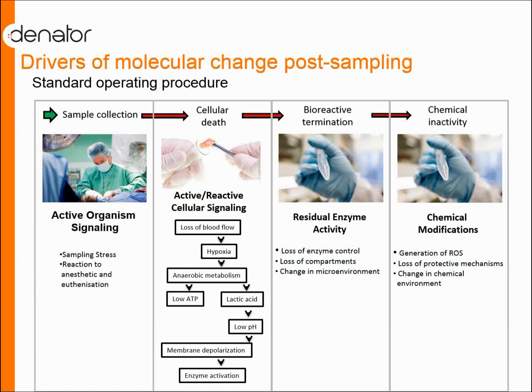what happens with the sample, homogenization and analysis, we like to define 4 stages of sort of activity, or stages of death. You have the first stage to the left here, where it's the sample collection, where in this case it's a patient sample. So here the patient is alive. In the case of, say, a small experimental animal, that stage usually ends by the death of the animal. And what we have then is the removal of the sample, and the sample itself is very much still alive and experiences a very traumatic event.